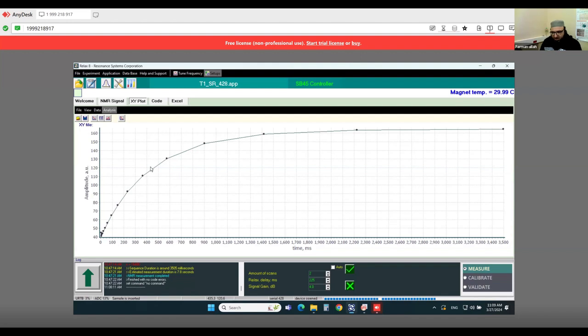I'm starting from the first sample; you have seen some of the FFC relaxation curves of these samples last day, and today I will present the time domain data of these samples.